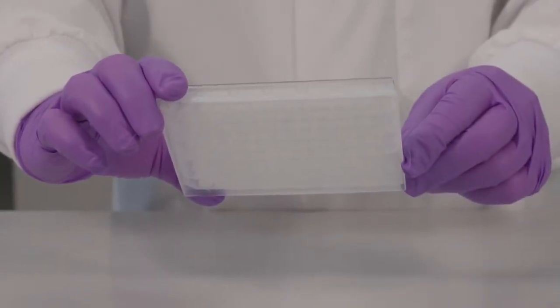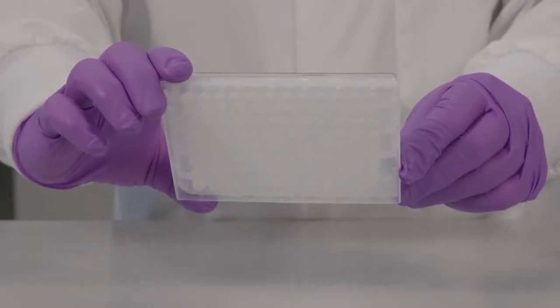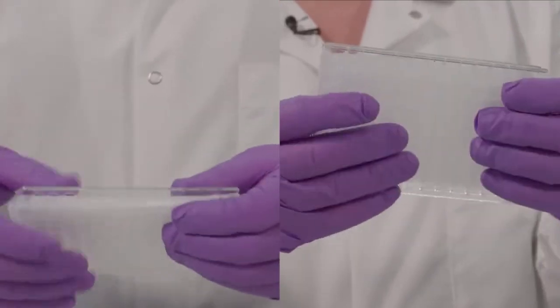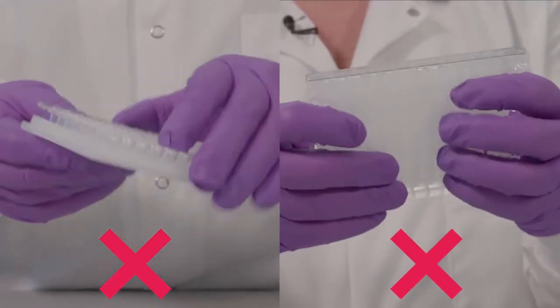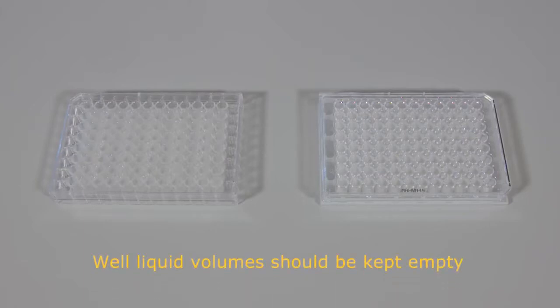The under drains are on the bottom side of the wells, where each well has its own drainage outlet spout. Be sure to note: once the under drains are removed, they cannot be fitted back together properly. For best results, well liquid volumes should be kept empty, as the removal process may cause unwanted splashing or spills.